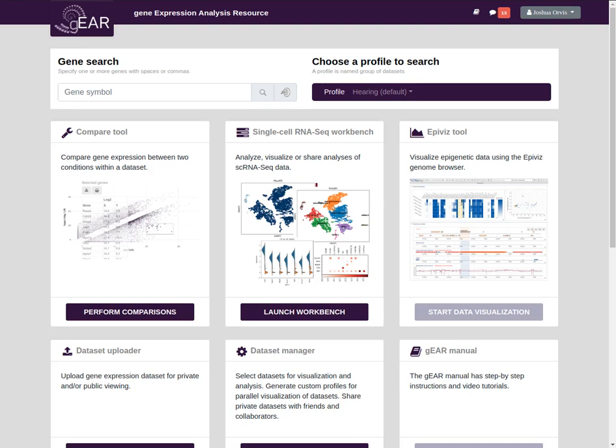In this video, I want to introduce some of the basic usage of the gEAR, sort of the things that will just get you started. Searching for genes, viewing expression, etc. Further videos in the documentation set go into the more advanced topics, but in this one, we're just going to cover the basics. To start with, gEAR can be used by anybody without creating an account.